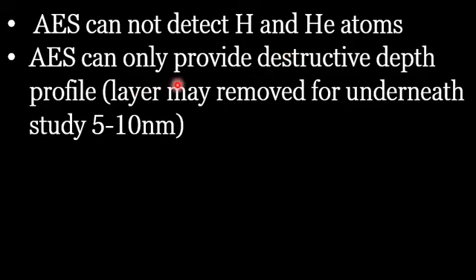Another drawback of Auger electron spectroscopy is that it is a destructive technique.